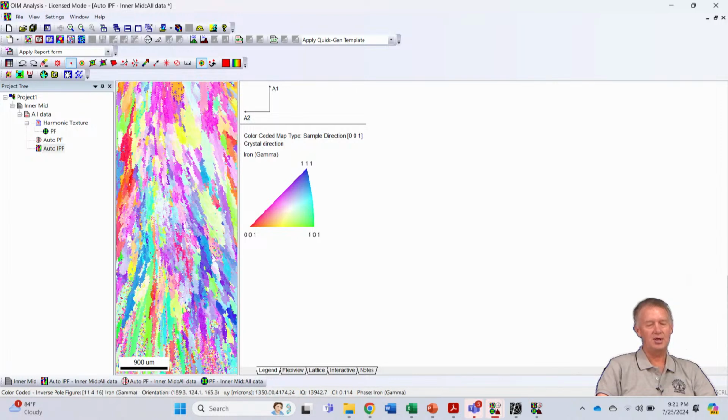So if they were growing straight up and down, we would expect them all to be lined up in the right direction. But we see them coming off to the side, right? So it's spreading. They're not all completely straight up and down. Some of them are starting to spread. Okay.